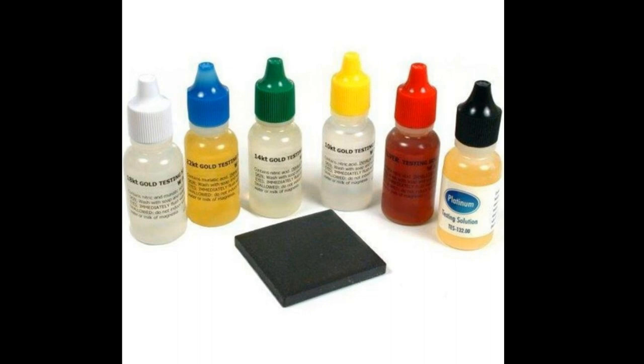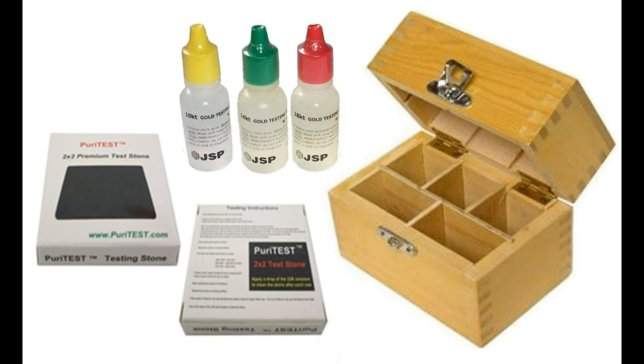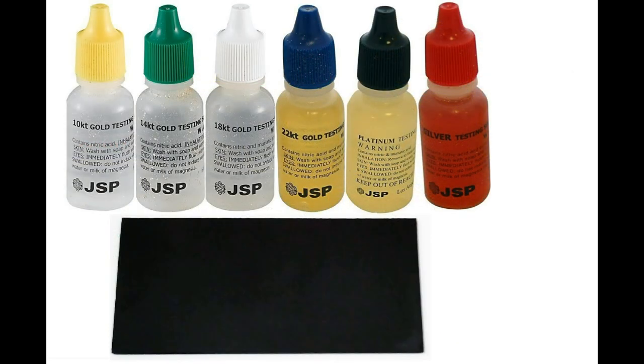Touchstone tests are accurate to roughly 15 parts per thousand and are based on the fact that 24 karat gold resists all but the strongest acids — the purer the gold, the stronger the acid required to dissolve it. Measured strengths of nitric acid solutions are used to test for 14 karat and lower purities. Aqua regia, which is a mixture of one part nitric acid and three parts hydrochloric acid, is used to test higher karat purity. A standard touchstone kit will usually come in a storage box and will consist of half-ounce bottles of specific testing solutions for specific precious metals or specific purities of gold.